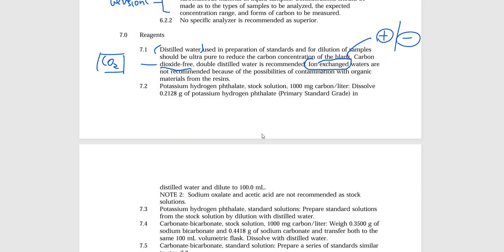So for instance, your tap water at home has things like calcium, so Ca+2, and magnesium. It's got that as well. And we are trying to remove those things to clean the water up a little bit. Absolutely, that's what we're trying to do. That magnesium also, by the way, carries a charge. So we need to get rid of those. We do that very easily through our ion exchange tanks. And that's the water sample that you will find in those faucets and sprayers in our laboratory area.